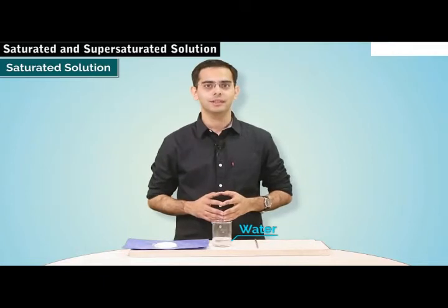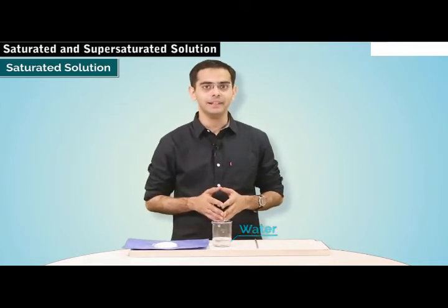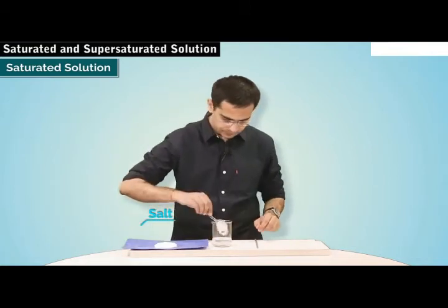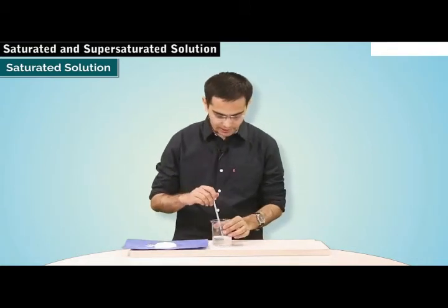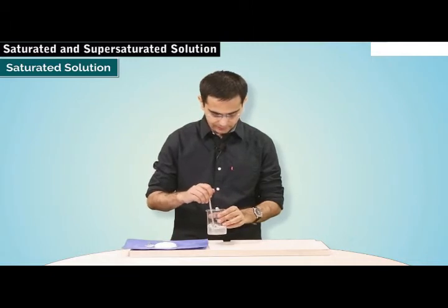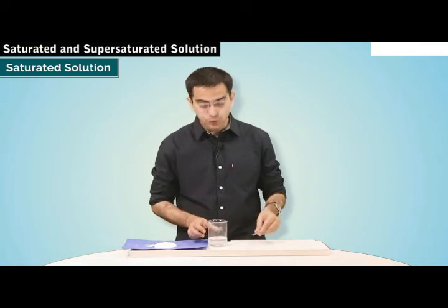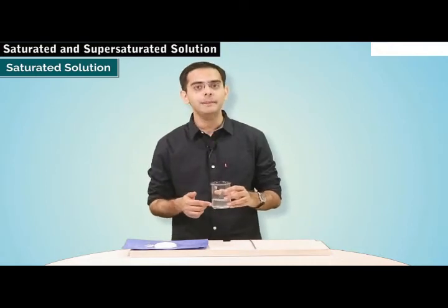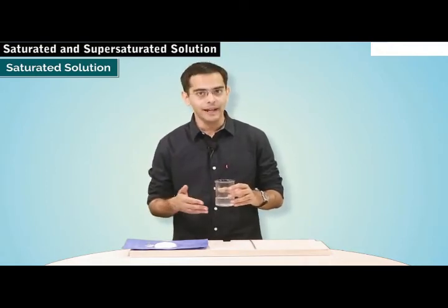So here is a beaker which is filled with some water. Let's add 1 spoon of salt in it and stir it well. So I add salt into it and now I stir it. Okay, so students, do you observe any salt particles being suspended or settled at the bottom of the beaker? No, right? That's because on stirring, the salt got dissolved in water.